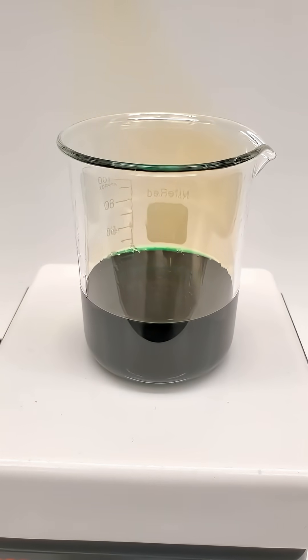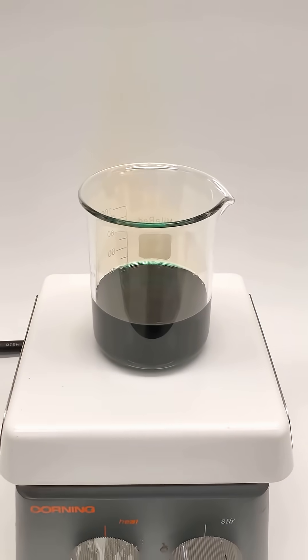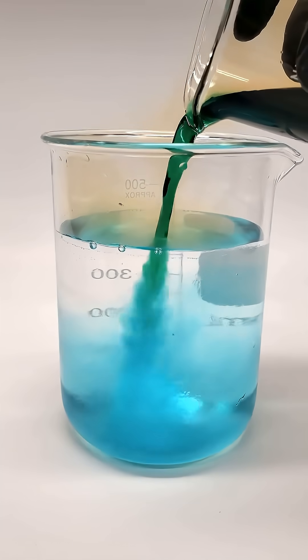It took about 10 minutes, but the penny's completely gone now. The color's also green, because of the copper nitrate that formed. If I pour more water into it though, it instead makes a really nice blue color.